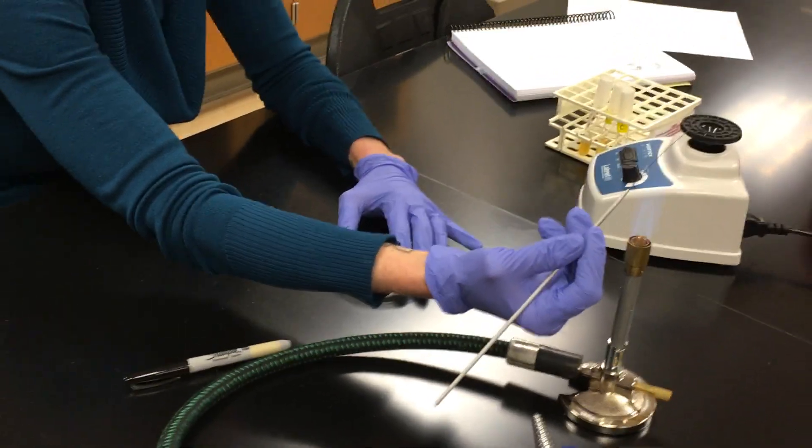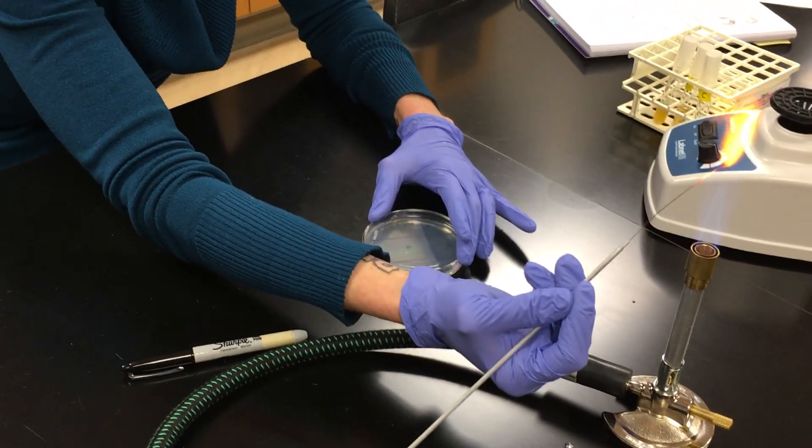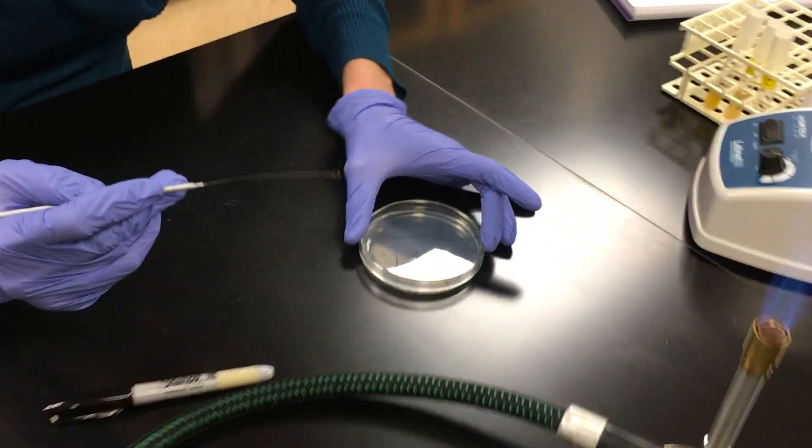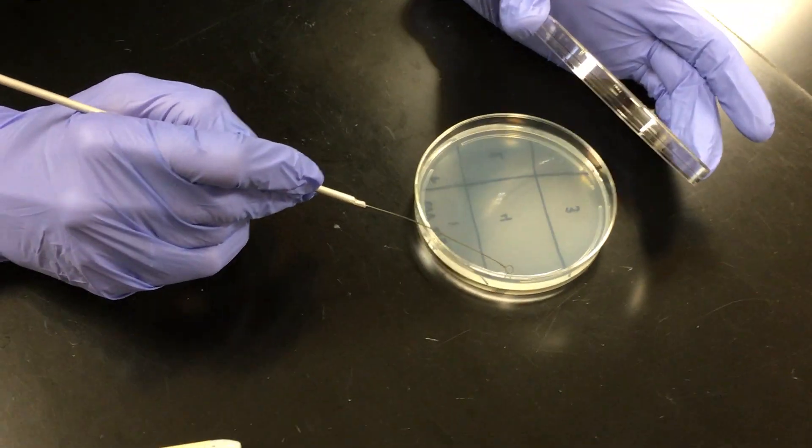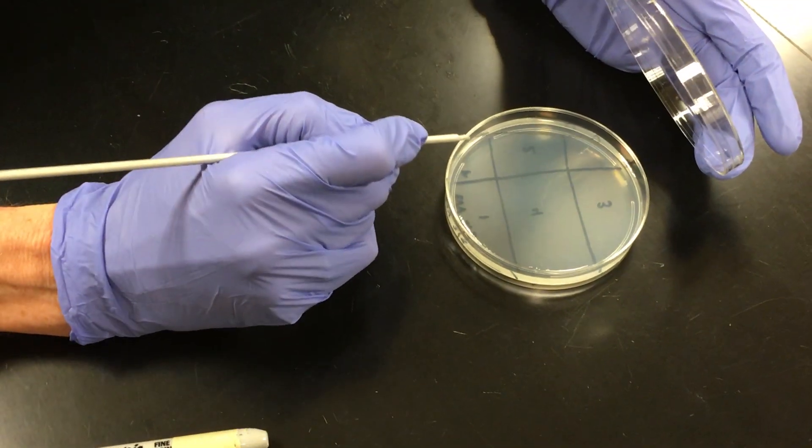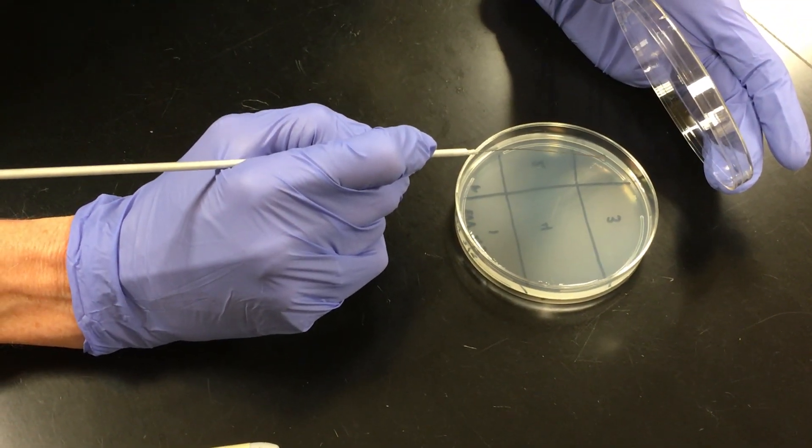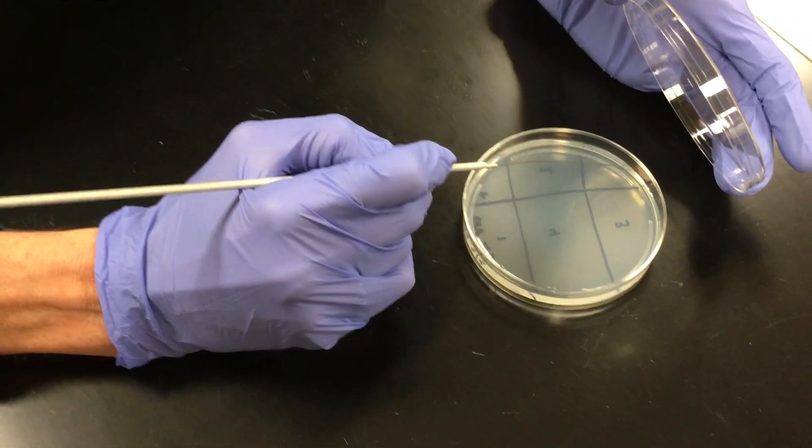You're going to reflame. Turn your plate. So you're looking at number three and this is hot. Remember, so make a little sizzle spot over here in four this time, close to the edge. Now I'm going to go into the, I'm going to cross into quadrant two as I'm streaking across quadrant three.